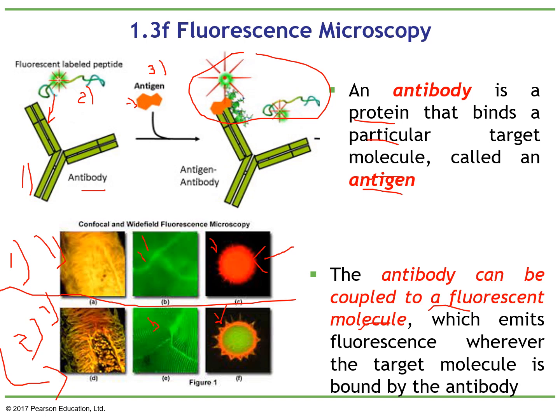So what we're going to do is to have a microscope that filters the excess of light, removes it, and we can have even more resolution. Again, this is a relatively complicated topic.